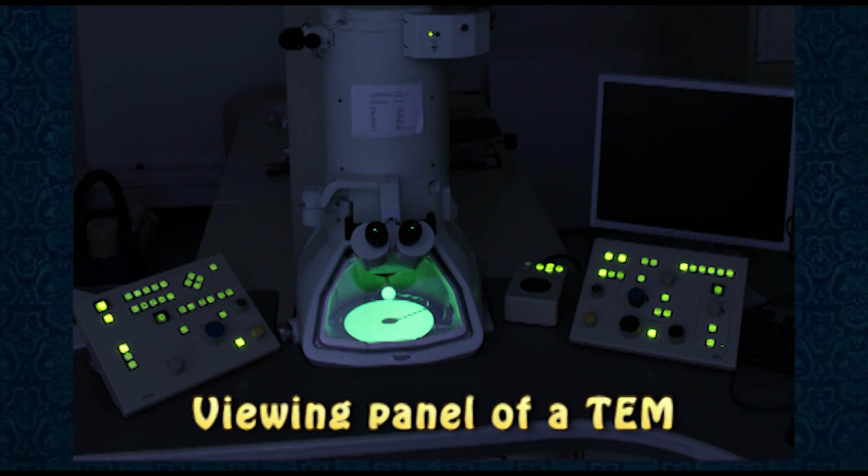In accordance with the name, the process of transmission electron microscopy involves producing an image via passing accelerated electrons through the specimen and onto a fluorescent screen. The image data is collected here based upon how the electrons interacted with the substance, in much the same way as X-ray imaging. In order to accomplish sufficient electron transmission, the specimen needs to have a thickness on the order of nanometers. This is to make sure that enough electrons interact with the specimen as well as ensure that enough electrons will pass through it.